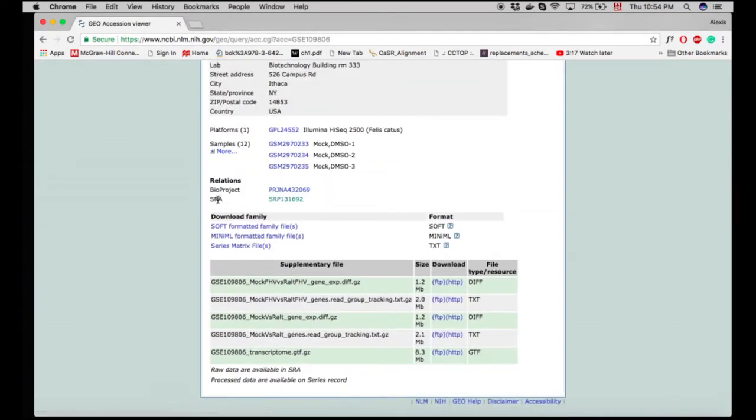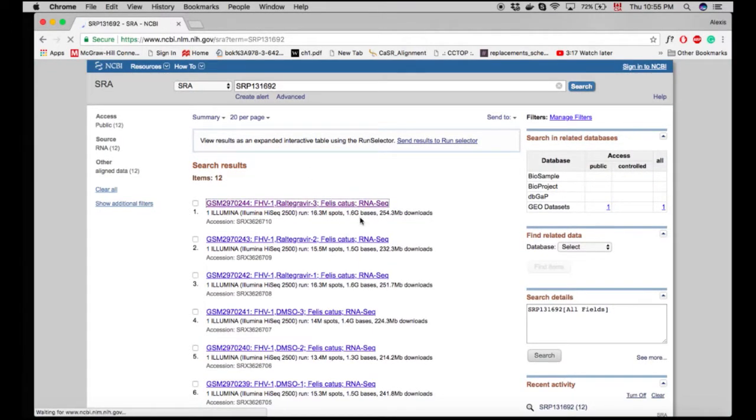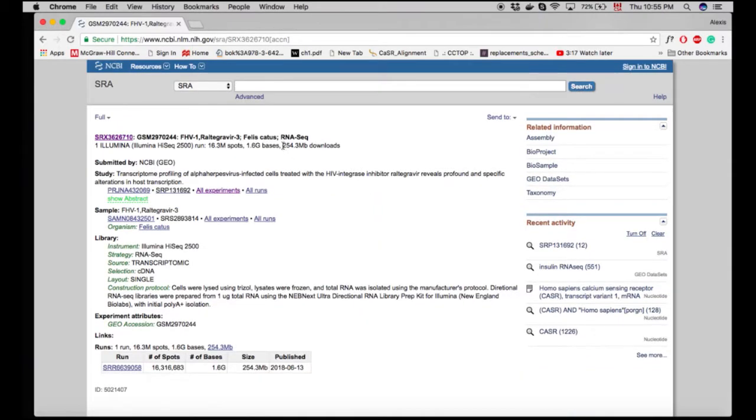And here we are. Hop onto the SRA, as you've seen, I've been there already, and let's take the first one. As you see, the file is not too horribly large, it's going to get slightly bigger afterwards. But I'd say it's quite a lot of bases, so it's going to give us pretty good data. So stay here, and remember, we'll need this SRR number right there.